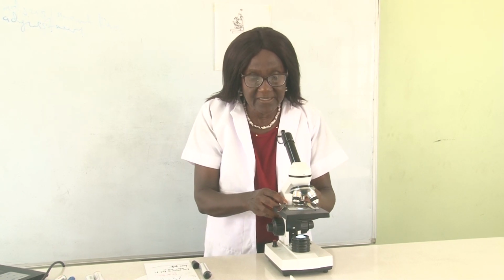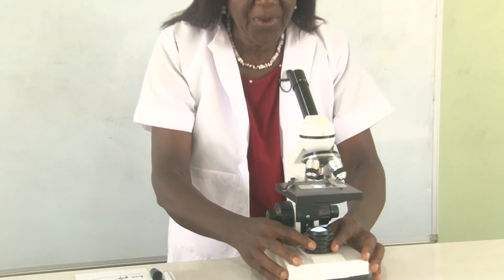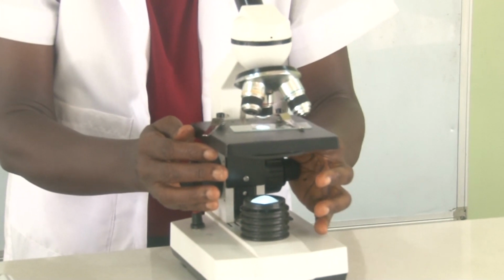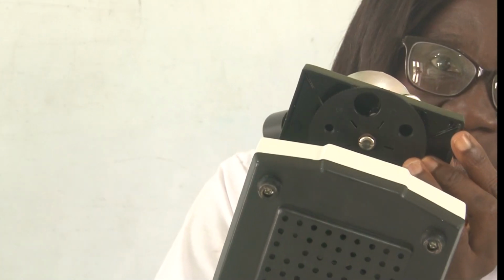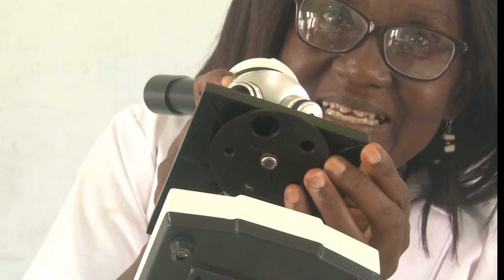In our last lesson, we discussed the parts of the microscope, which I will quickly go through using this. We have the light in here. We have a condenser and a diaphragm low here, so you can increase or decrease the amount of light getting through.